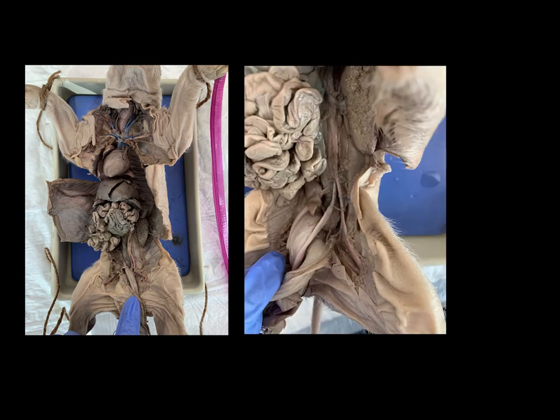And the last vessels that you need to know on the fetal pig, we're going to be looking at this region right here. Over here we're pushing that structure to one side, here we're pushing it to the other side, but it's still the same thing. And again, for this fetal pig, you don't need to know it, but to help you identify what we're looking at here, this large structure right here is the pig's urinary bladder.